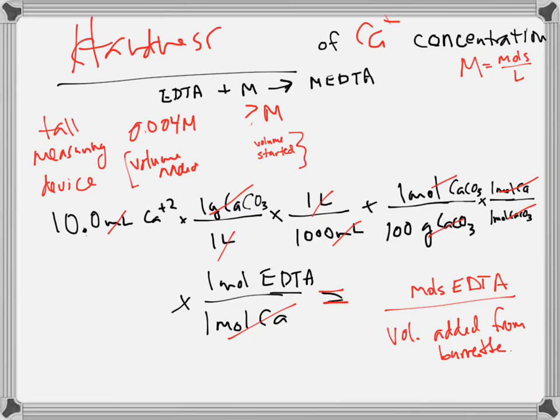Whereas the other one has a pipette. And that one's volumetric, I believe. Okay? So now when we go through and do our calculations, ultimately we're going to get very similar, except now all of our units swap and we pretty much flip everything. We do the reciprocal of our calculations. Okay? What if we did that next titration incorrectly?